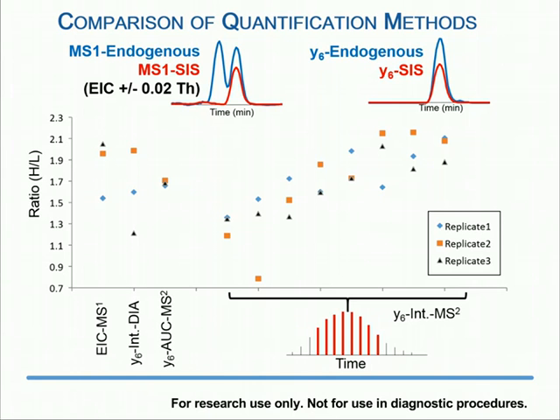As we look at the individual targeted MS2 values, you can see the source of that variability. Very early in that acquisition, we have very low signal, we have lower heavy to light ratio, but after a time that kind of normalizes out, and as you average all of this, you do end up with the average value that's the integrated area under the curve at the left there, but a high degree of variability between the replicates for using any single spectrum for the DIA measurement.